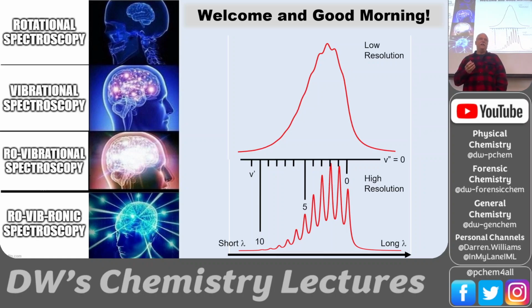So in the ultraviolet visible region, we're dealing with electronic transitions. So this is the electron cloud. If it's visible, it's probably the double bonds, things like that, maybe an extended system, because most molecules will absorb in the UV, but if they absorb in the visible region, they're probably a bigger molecule.